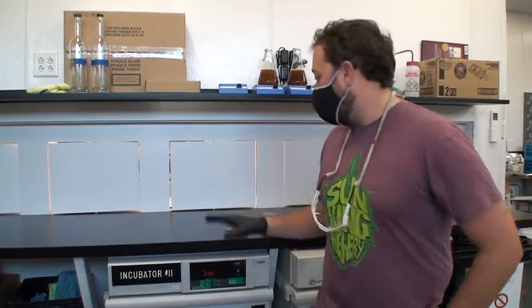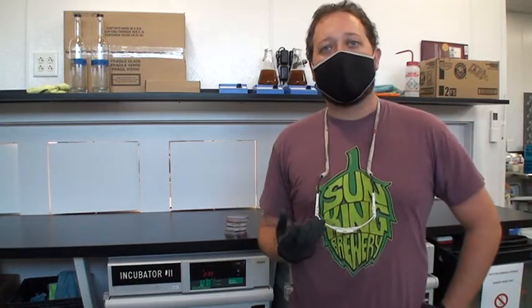A better option for smaller breweries is something called HLP — it's a broth, not an agar plate, it's an actual liquid. You get a sterile test tube, drop it in boiling water for a few minutes to sterilize it, then you make this HLP broth — Hsu's Lactobacillus Pediococcus broth. It's a clearish, yellowish liquid. Put a sample of beer in there, let it sit at room temperature for a few days. If it turns cloudy, it means there's bacteria. If it stays clear, there's not. It's a really cheap, easy way to do a small micro program at a small brewery — you don't need an autoclave, an incubator, or anything fancy, just some test tubes.